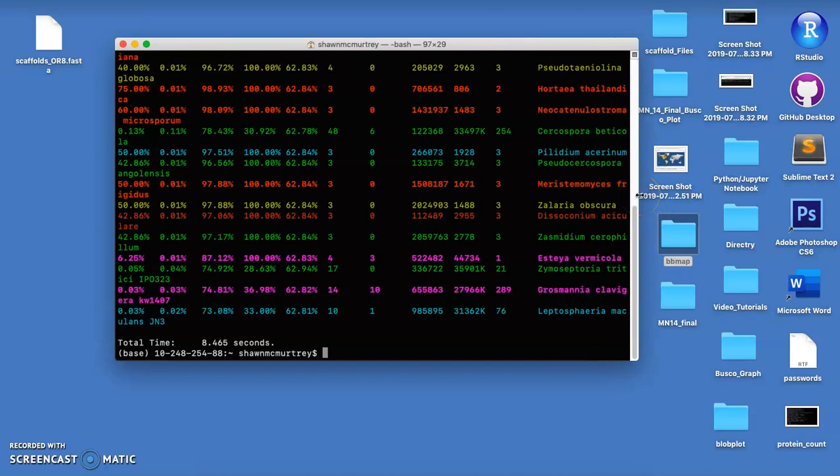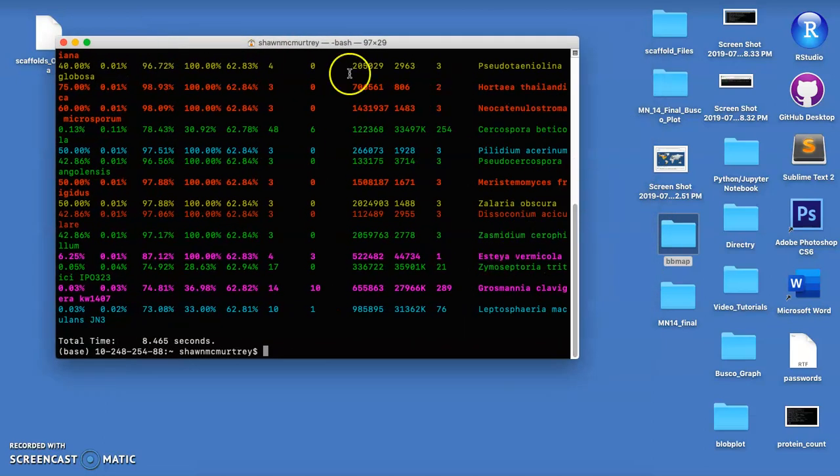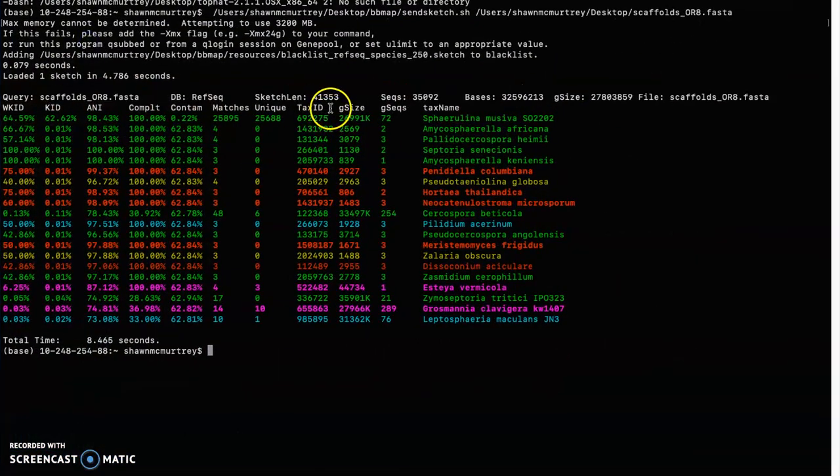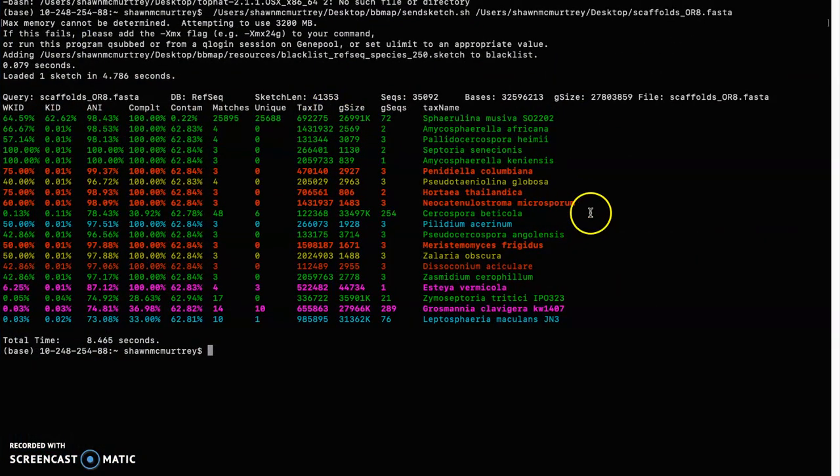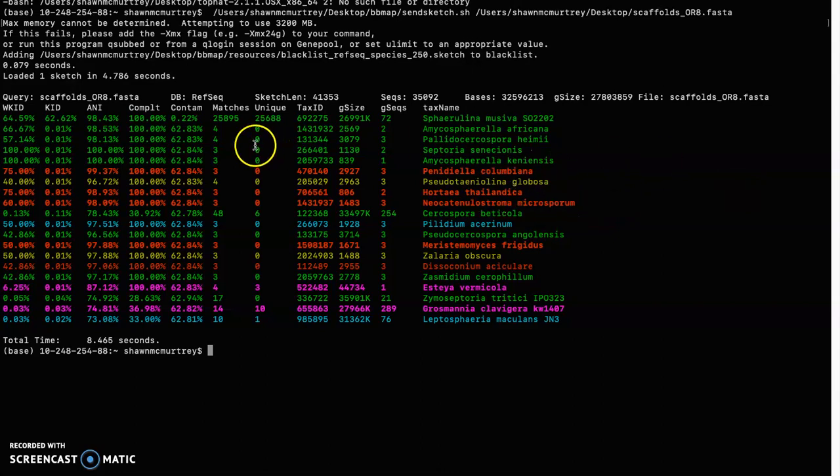You can also create plots with the data afterwards which hopefully I'm going to be able to do that and show that in another video. But essentially here's the main thing we want to look for, it compares our genome to the S. cerevisiae reference genome.